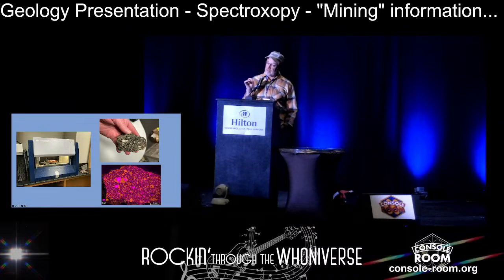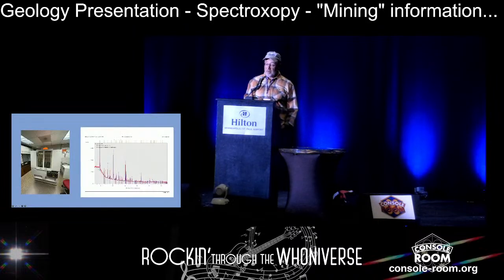So we picked out a couple of small crystals, crushed them, and ran them in the XRD. The XRD gave us 2 possible options. In fact, there were more that we could put in there. It's a zeolite mineral called chabazite, and we don't see that in great frequency on the North Shore. But we wanted to know which one.